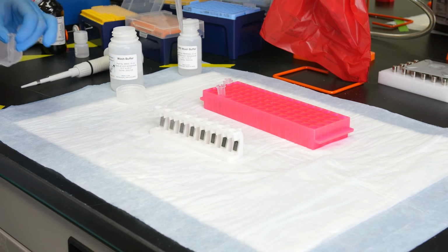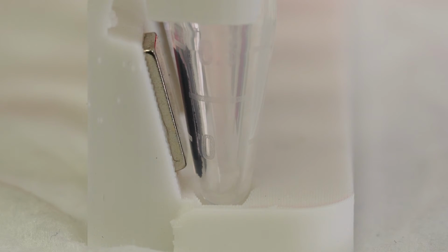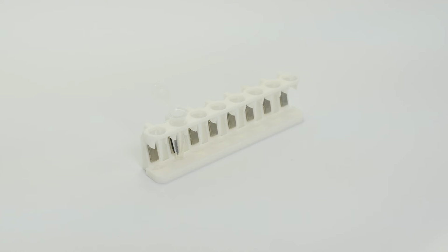Now to get the RNA back off the graphene, we're going to allow the ethanol to evaporate and add RNase-free water. Uncap the sample and place it in a hood for 10 minutes. This drying time can depend a bit on temperature and airflow in your room.